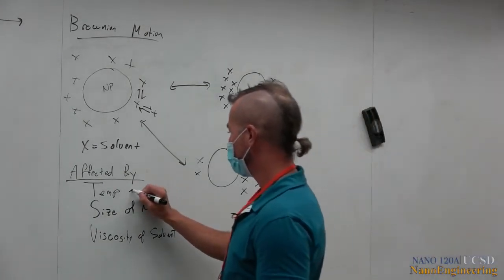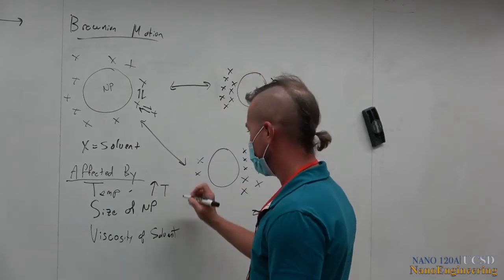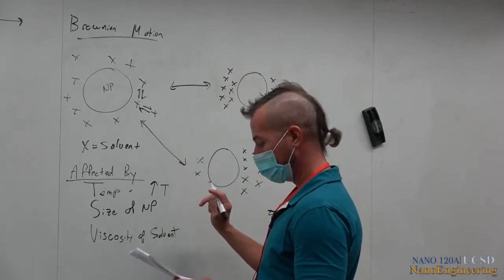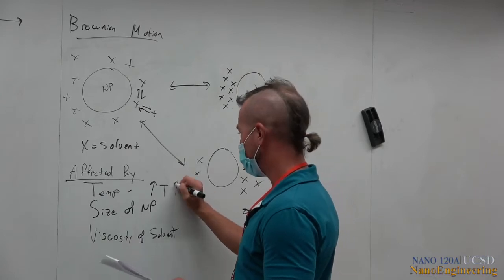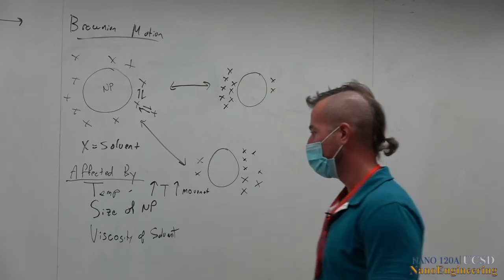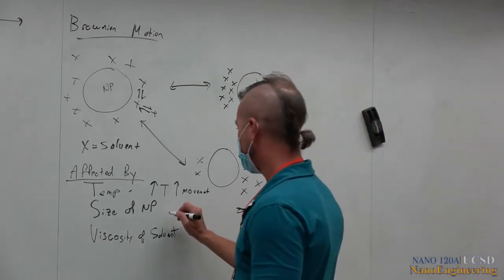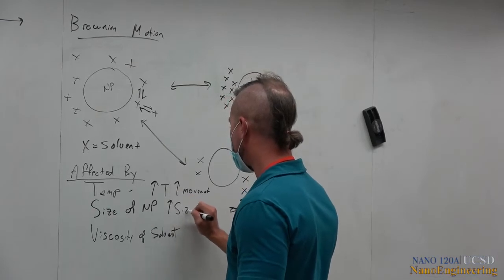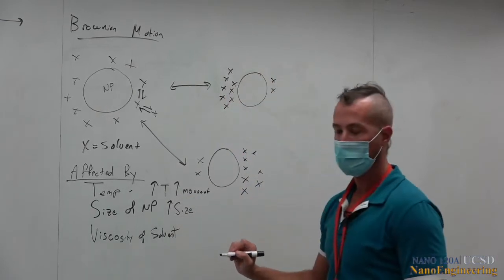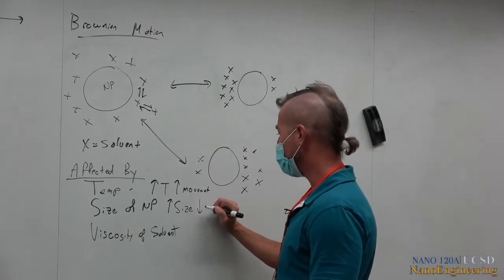So increased temperature, increased movement. That makes sense? Increased size, bigger particle, decreased movement.